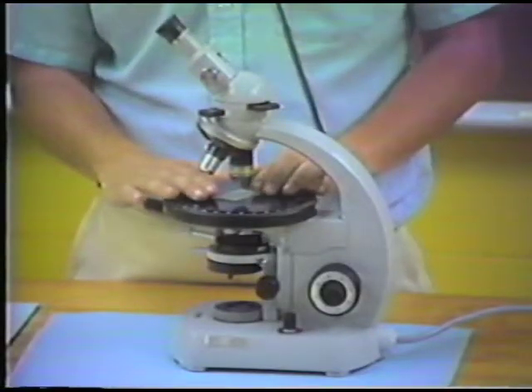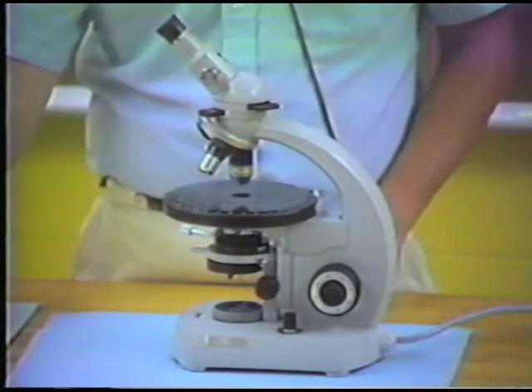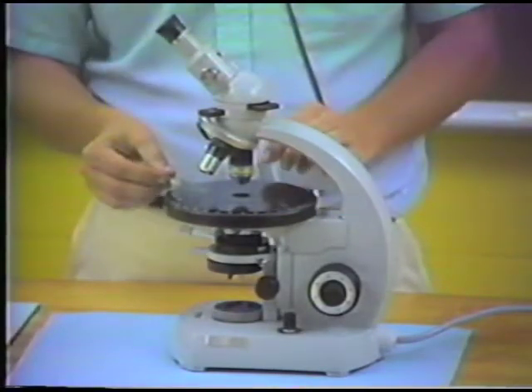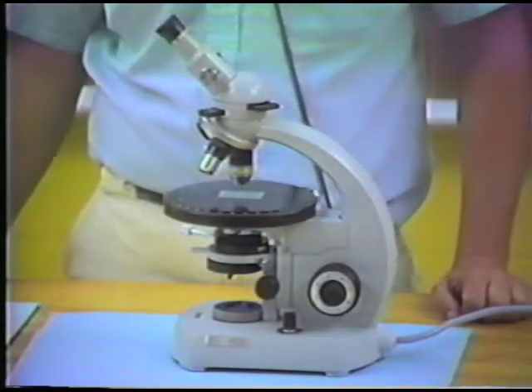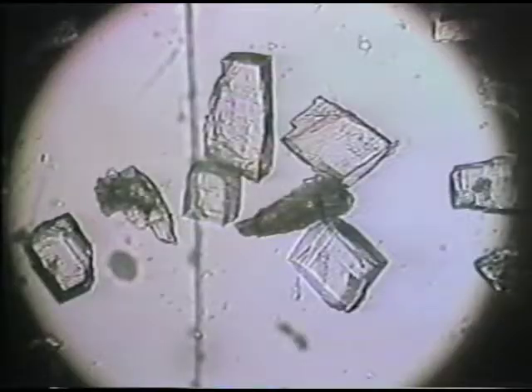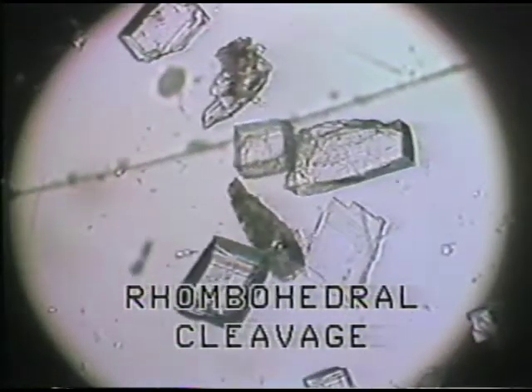Now another kind of cleavage that is particularly important in uniaxial minerals is shown by the mineral calcite. And so I've got another thin section which shows the rhombohedral cleavage of the calcite, and a very similar kind of cleavage is shown by other carbonate minerals.